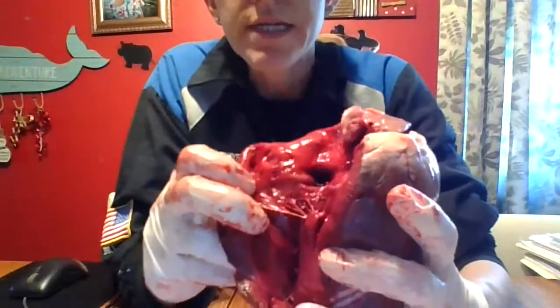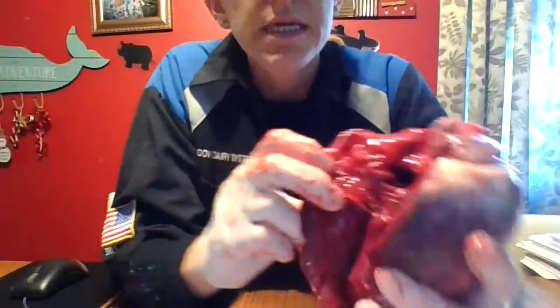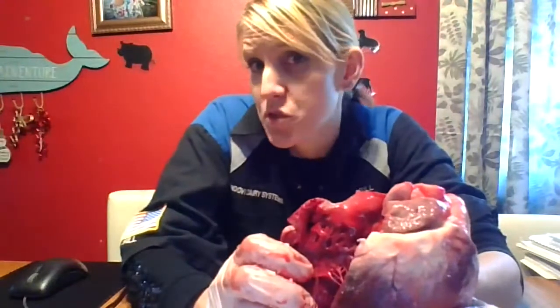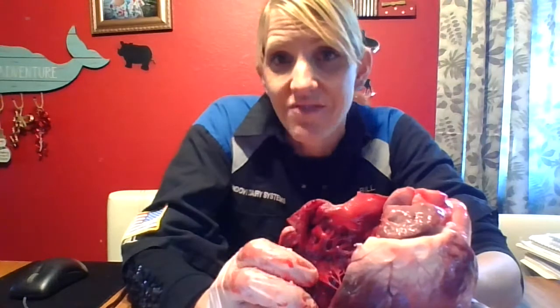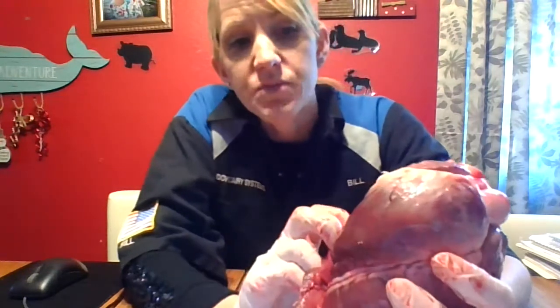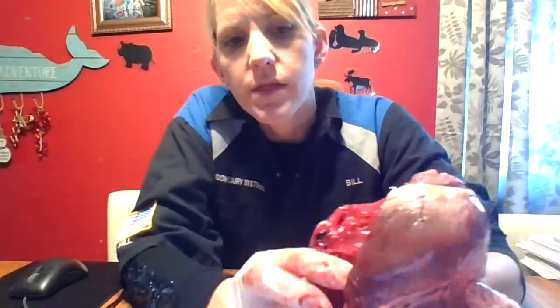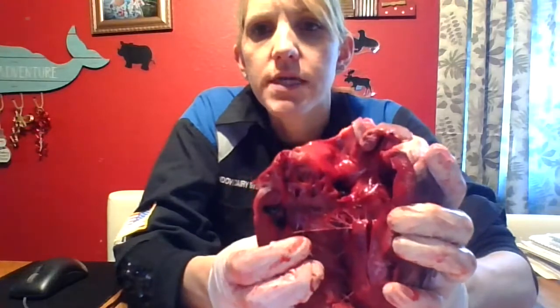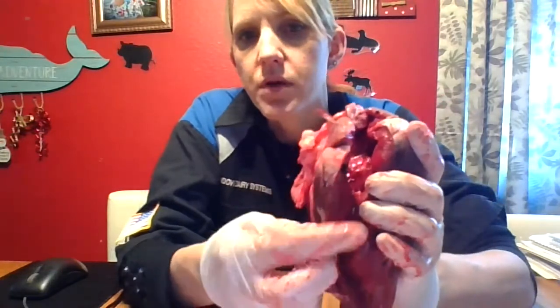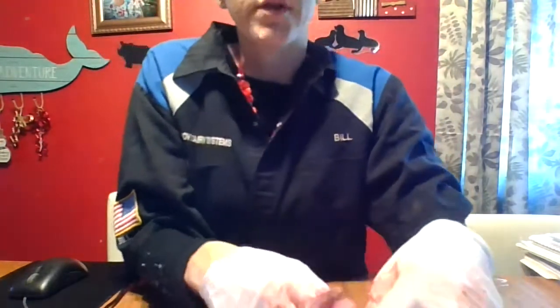See that chordae tendineae? They look like guitar strings — ding, ding, ding. You can play them if you want. That helps to keep the valves in place. The valve that goes between the right atrium and the right ventricle is called the right AV valve, or the tricuspid valve, because there are three cusps. You can see the papillary muscle and chordae tendineae. Look at the thickness of this right ventricle — we'll compare that to the left ventricle later.